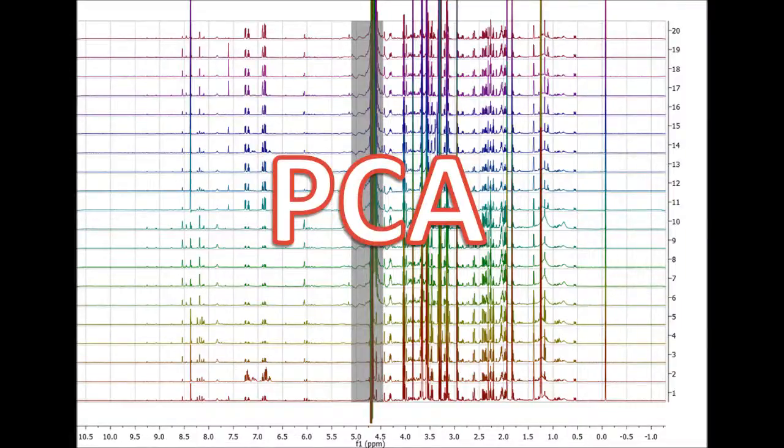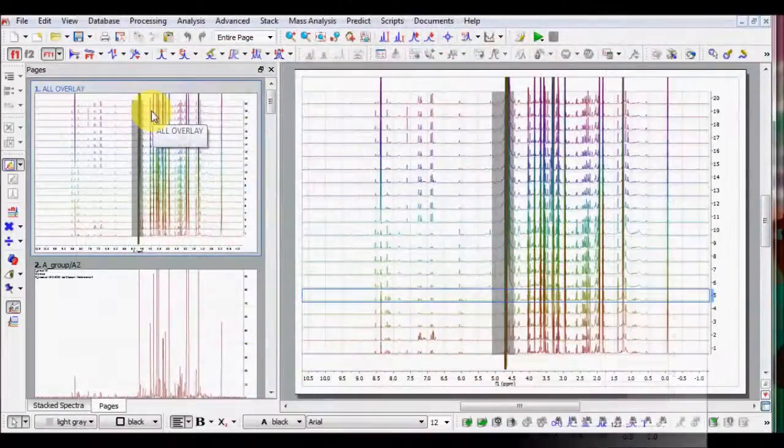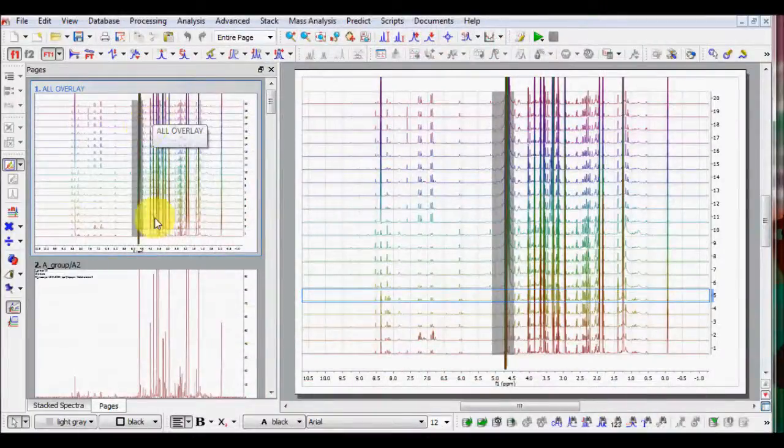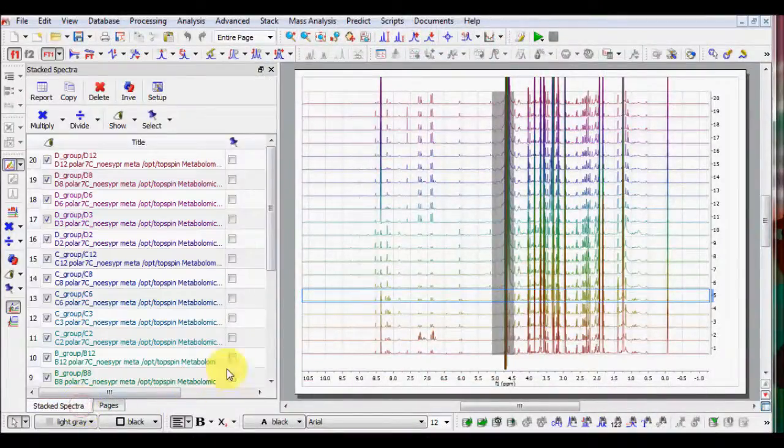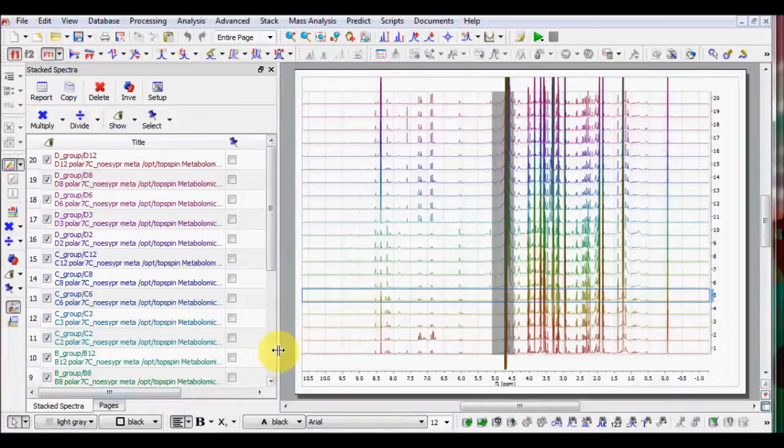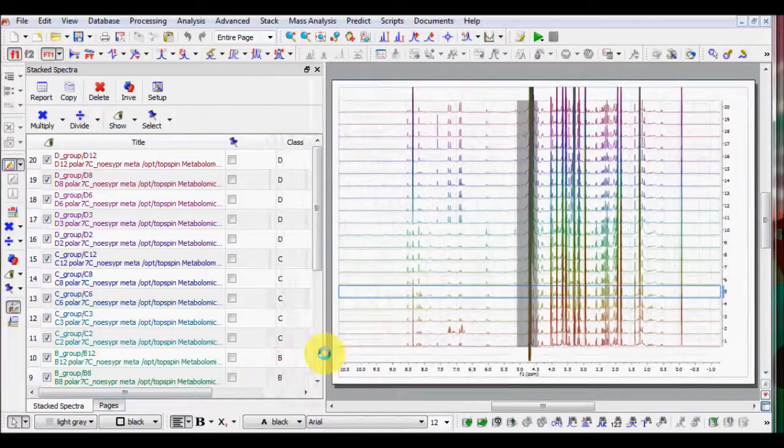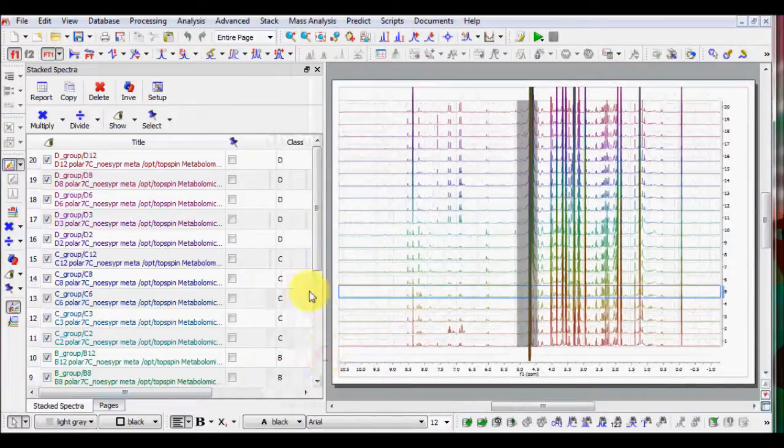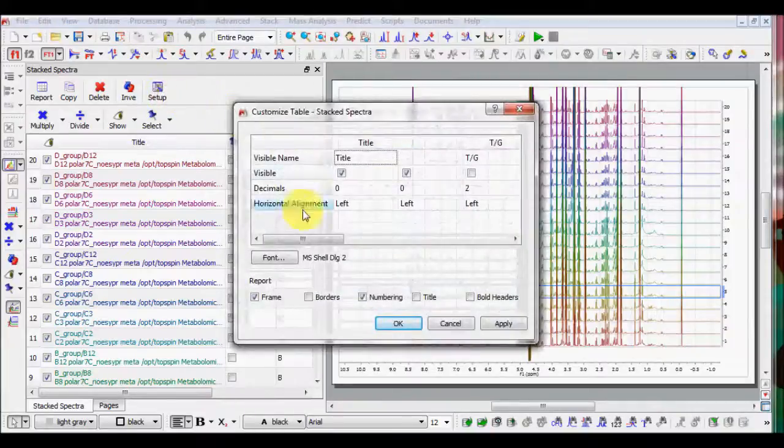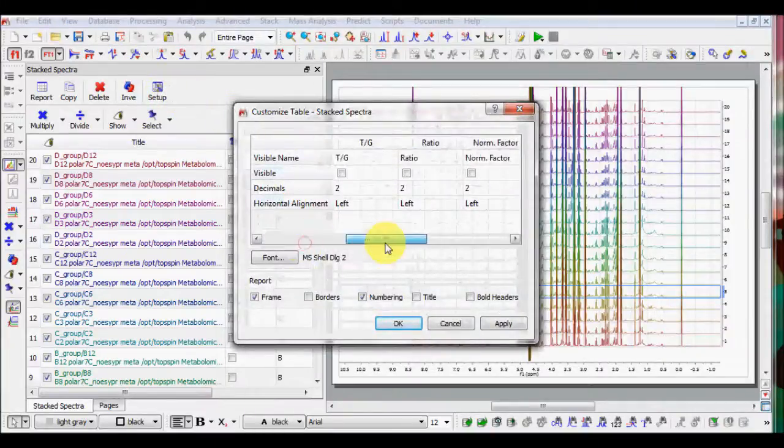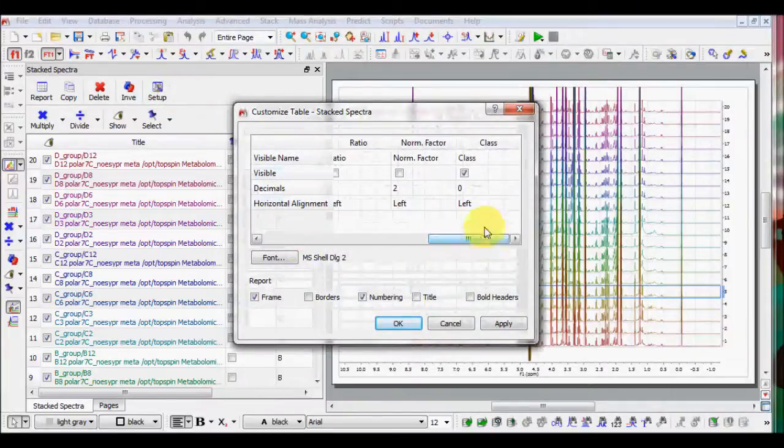Welcome to this short video about PCA capabilities under Emenova. First, select the stacked plot you wish to work with. Look at the Stacked Spectra table and fill in the class definition. If you don't see the class column, go to Table Setup and check the class visibility.